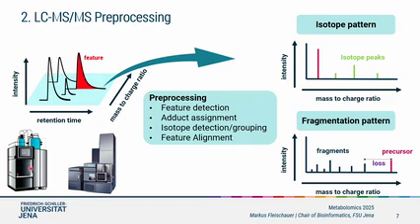So as you know, your LC-MS data is three-dimensional data, so you have your retention time from your chromatography.